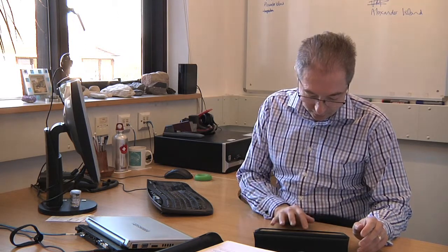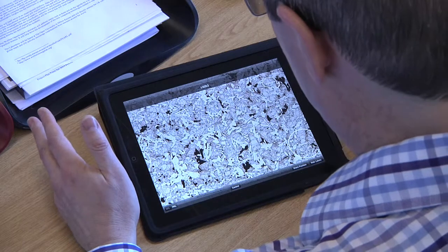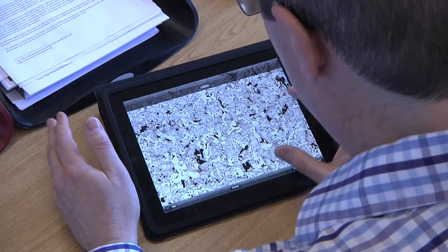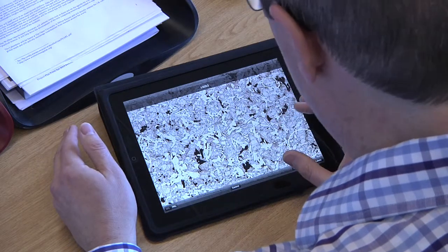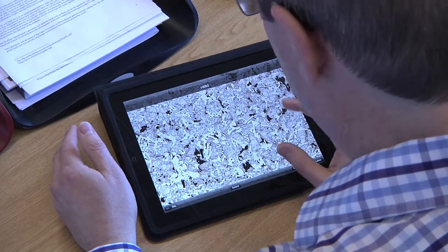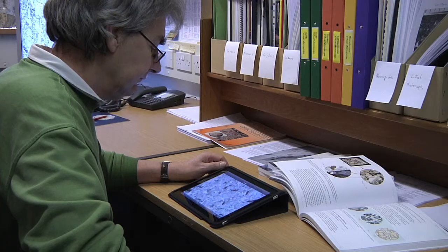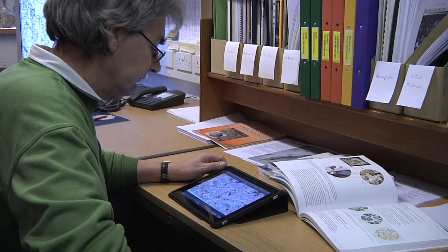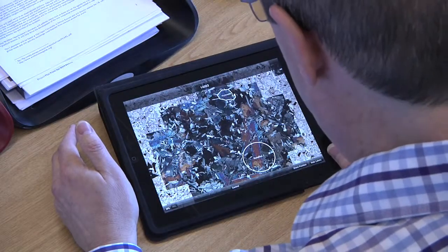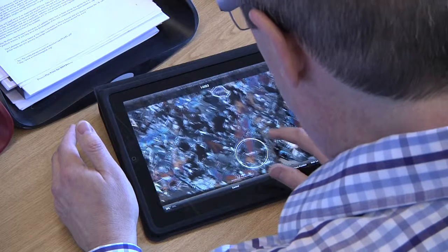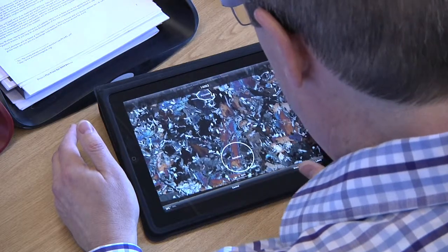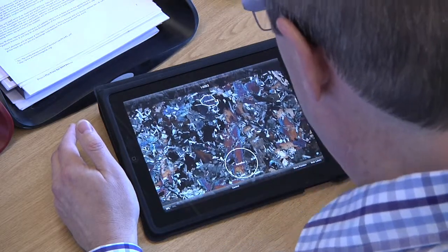Let's take a look at it together. I'll take control. There are quite a few olivines — they're quite small and they're embedded in the pyroxenes, Andy. Let's move across to the rotation. In fact, even in cross-polarised light, you can't see it. Can you take control and go into that rotation?